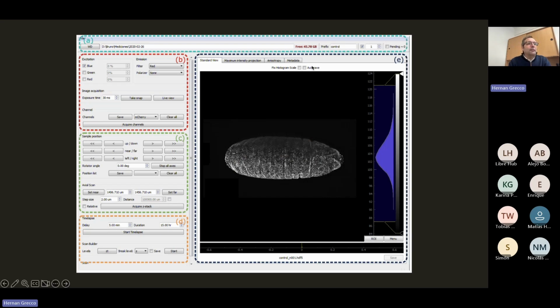I'm not going to show you the code, but the user interface has a part where you can select the excitation and the emission channel, the sample position. You can generate, if you want to do a time lapse, or you want to do a scanning set in time or set in channels. You can generate all of this. You have the image here, and you are saving the data as you go. So all this is controlled from Python.